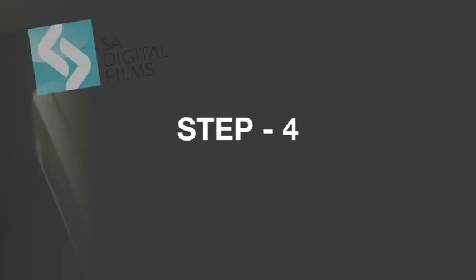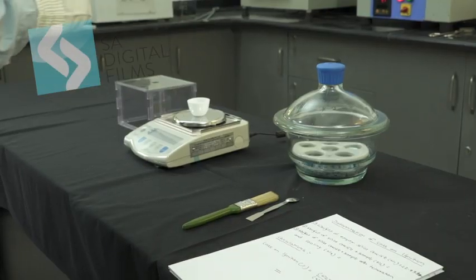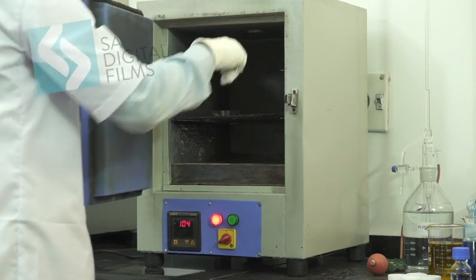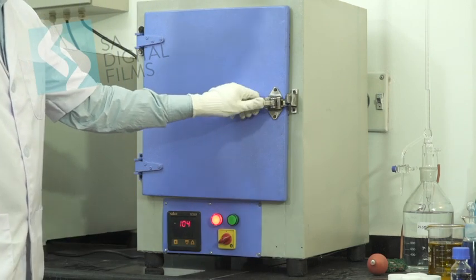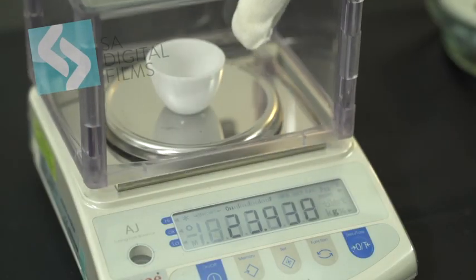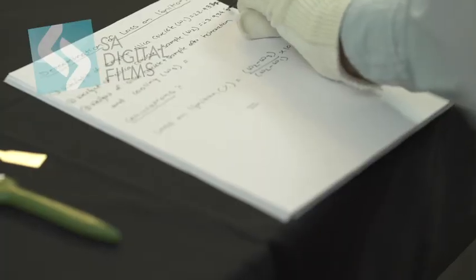Step 4. Add 1 gram of sample for which loss on ignition is to be tested. The sample should be previously heated at 105 plus or minus 5 degrees Celsius for an hour to dry it. Step 5. Note down the weight of the silica crucible with sample and denote it as W2.